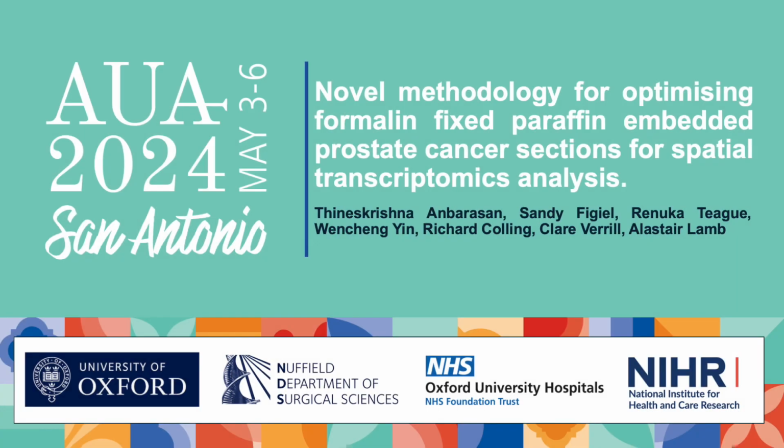Welcome to this video protocol where we will take a step into the exciting field of spatial transcriptomics. Here we will describe how we prepare formalin-fixed, paraffin-embedded prostate cancer sections for spatial transcriptomics.